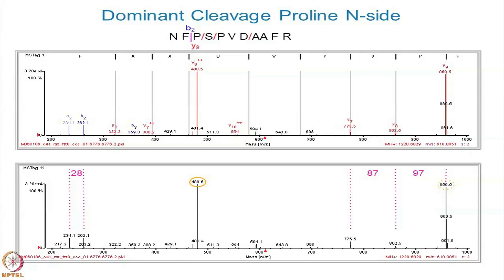Okay, there's the PS part. That's about all the information there was. That information all together is enough to produce that one answer as a peptide from the human proteome.